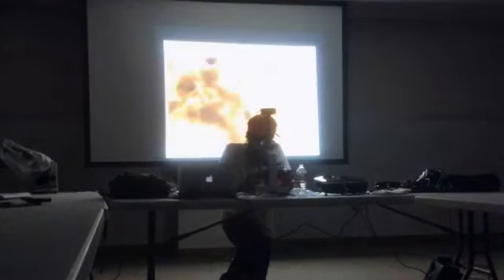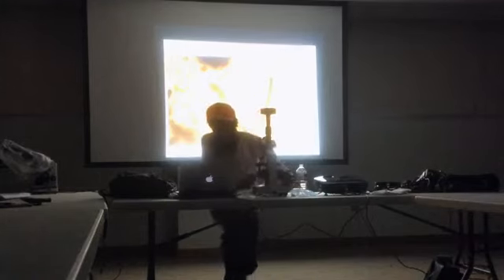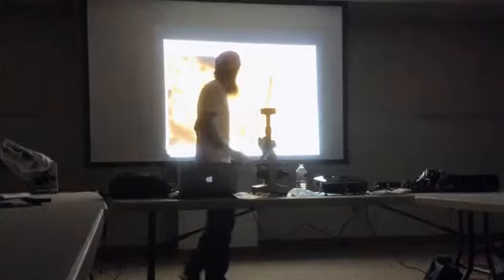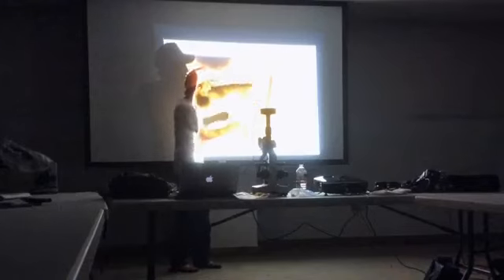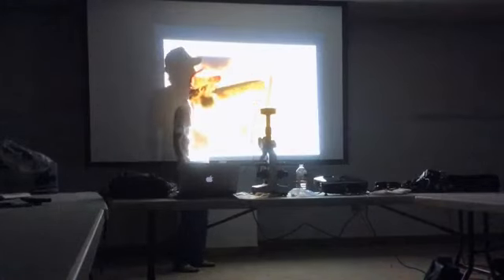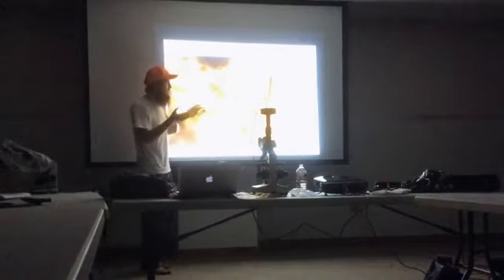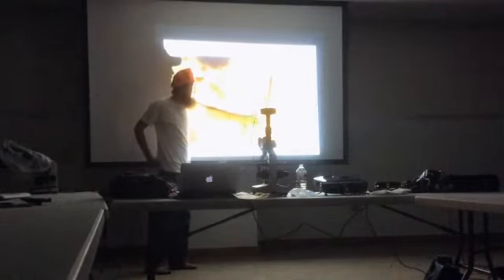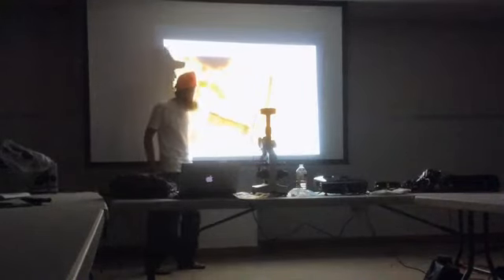But check this out in terms of fungus on my slide. I got some good stuff going here, and another thing. You see how this guy has segments in him? This is different than the yeast that were stuck together. This is actually one fungus with these segments, and the segments put it in a special family of fungus, but these tend to be also beneficial when they're segmented like that.